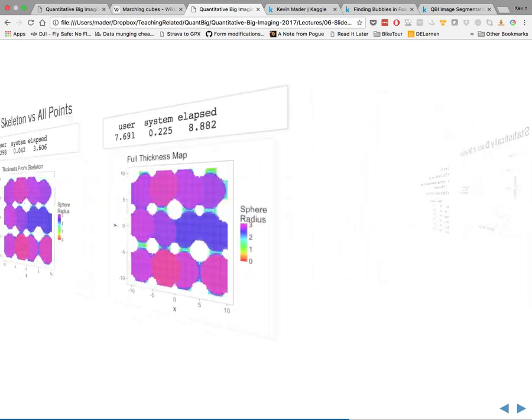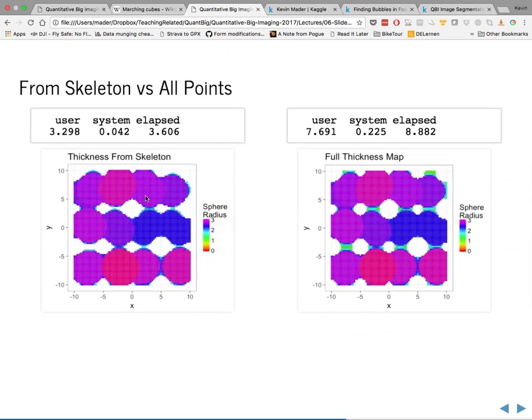Yeah, so if we take this image, like the image we had before, ignore the other information around it right now, you have this thickness map for your object. If you had done the thickness map on the white areas here, it would have told you something about the radius of the rods that you have going through this object. And when you do the thickness map on this area, it tells you something about the spacing between them.